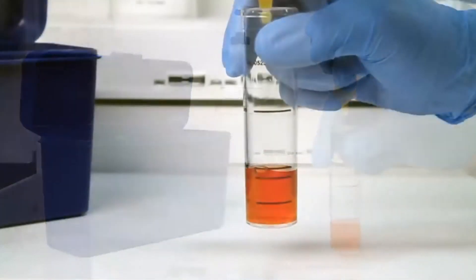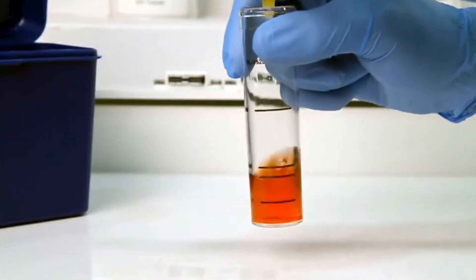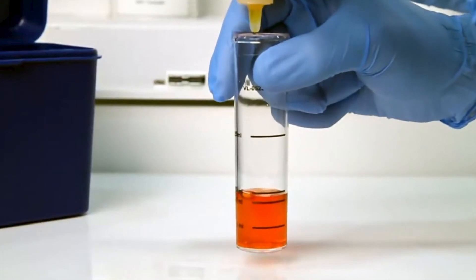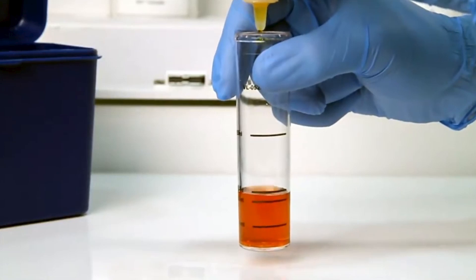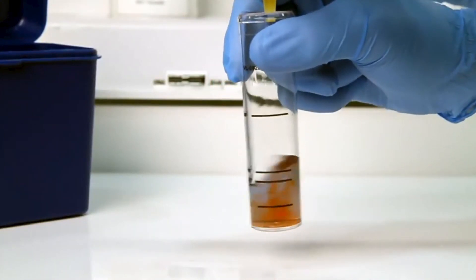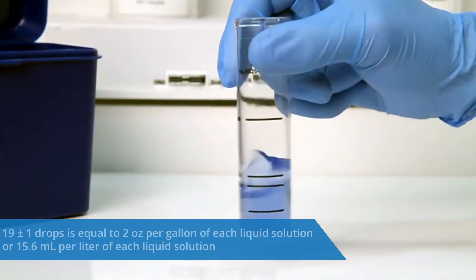After the addition of each drop of titrant, you want to swirl the vial to make sure the sample is properly mixed. Count the number of drops during this step. The titration is complete when the sample changes from orange to blue.